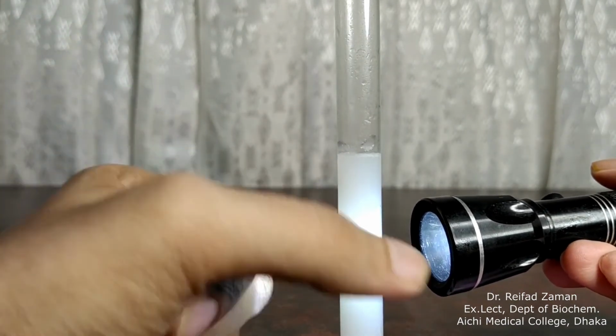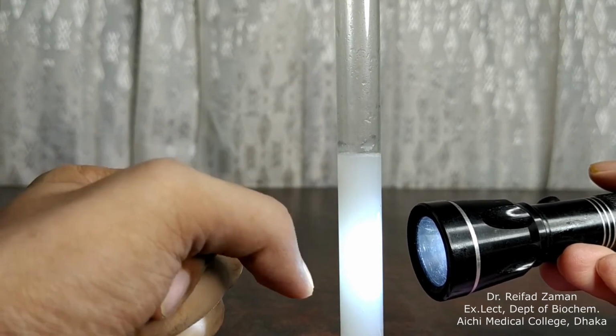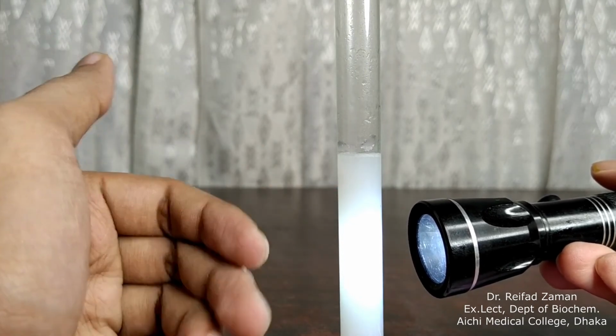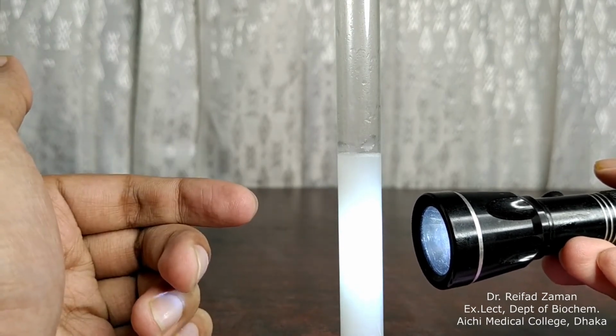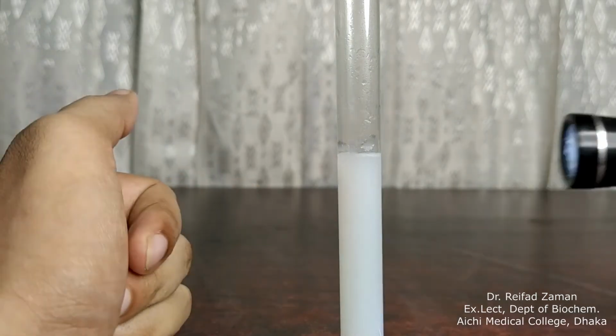But এইবার as the light is trying to pass through the solution, it is getting obstructed by the milk particle that are inside this tube. And ওই মিল্ক পার্টিকেল থেকে লাইটটা রিফ্লেক্ট হয়ে আমাদের চোখে এসে পড়তেছে। এই ফেনোমেননটাকে বলা হয় Tyndall effect, which is seen in colloidal liquids. So that's about preparation of crystalloid, colloids and suspension.